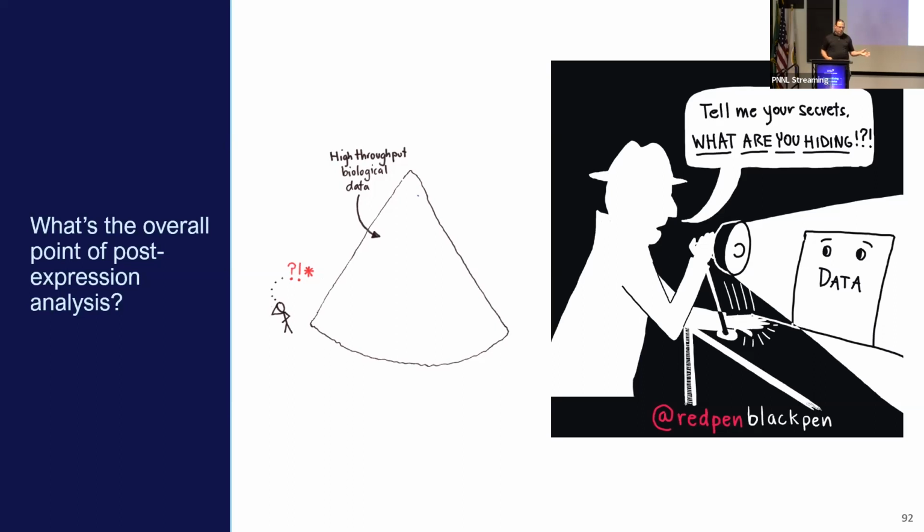In the example I just mentioned with Excel spreadsheets, this is totally not a joke: oftentimes when those are delivered to a bench biologist, they'll just sort on differential abundance and go gene by gene and say, oh, I know that one. Not sure what that one does. I think this one does something in this pathway. I think this one does something in that pathway.